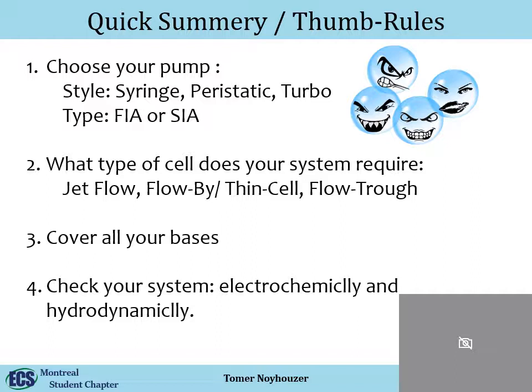And then check your system electrochemically and hydrodynamically. If you have something specific, check all of that.